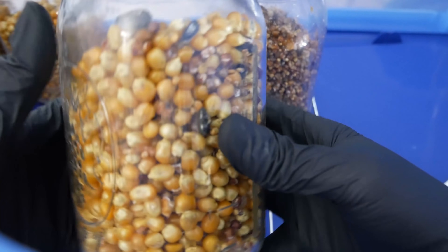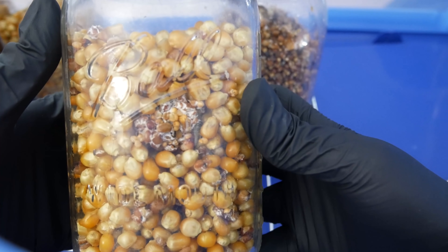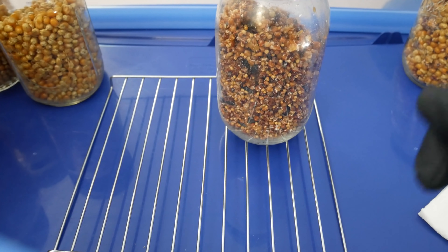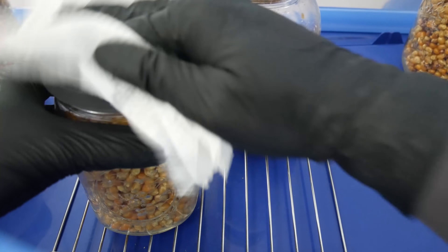That's how you do grain-to-grain transfers. Leave these jars out to colonize at room temperature — ideally between 70 to 80 degrees Fahrenheit, or about 21 to 28 degrees Celsius, to achieve nice healthy colonization.